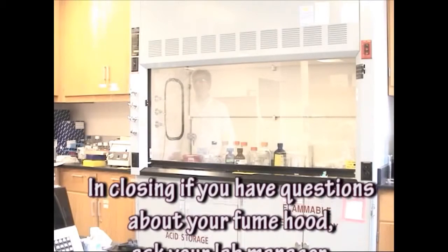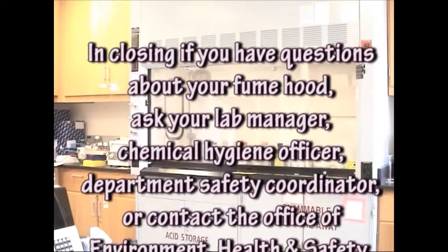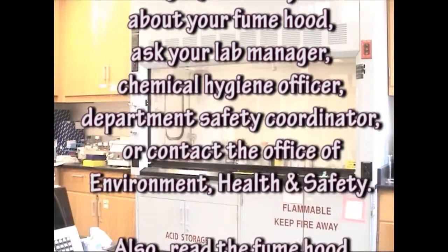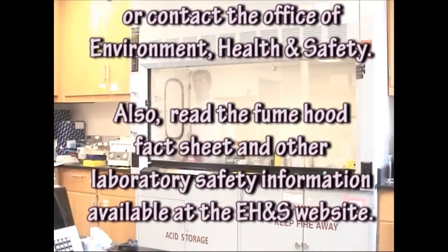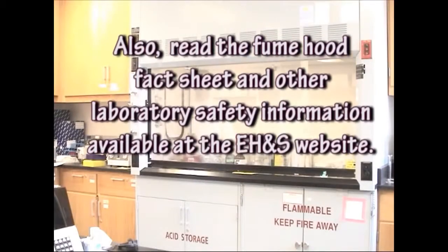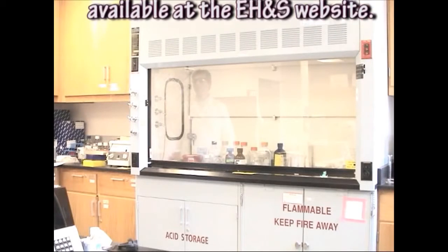In closing, if you have questions about your fume hood, ask your lab manager, chemical hygiene officer, or department safety coordinator, or contact the Office of Environment, Health and Safety. Also, read the fume hood fact sheet and other laboratory safety information available at the EH&S website.